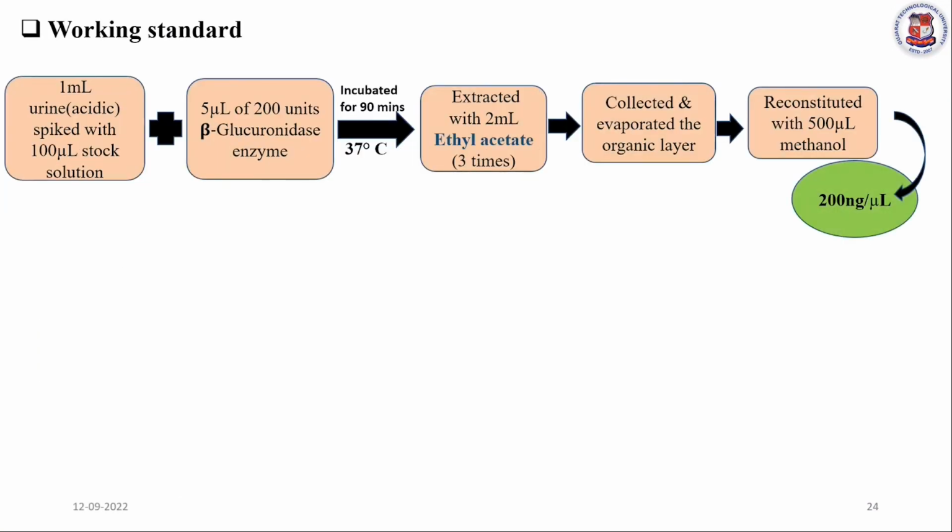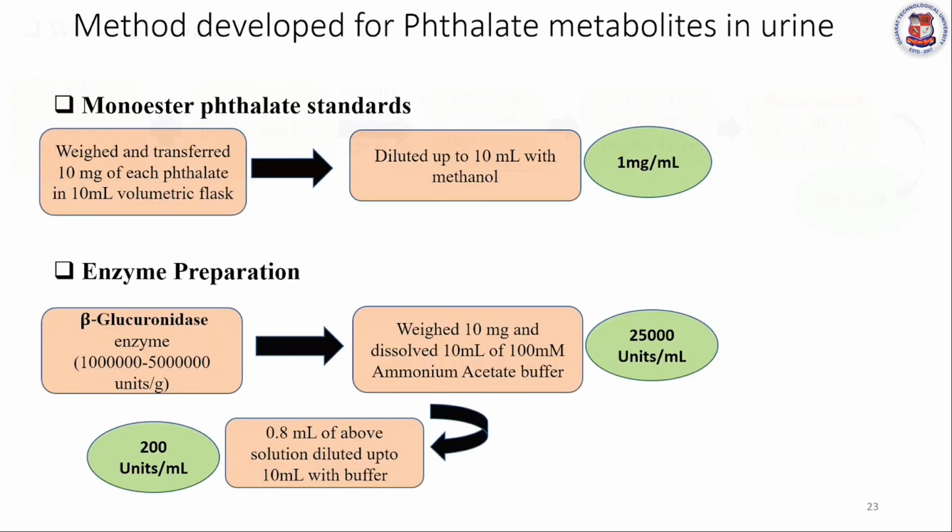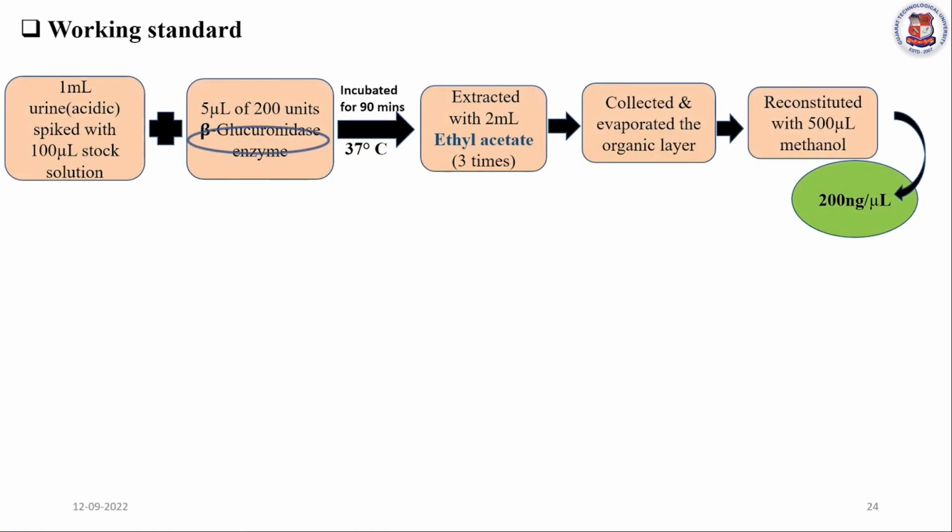These are the sample preparations. We have used the enzyme. We have used ethyl acetate as the extracting solvent, and we have also checked the effect of the enzyme.